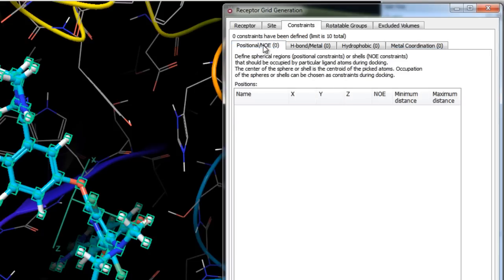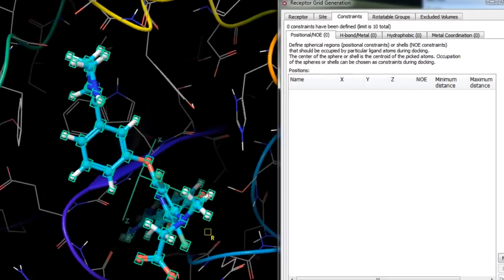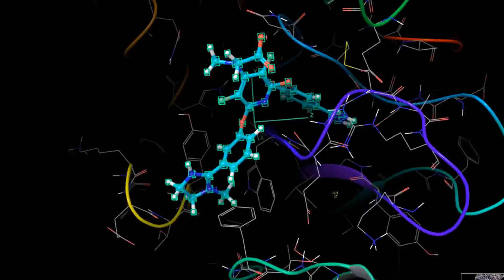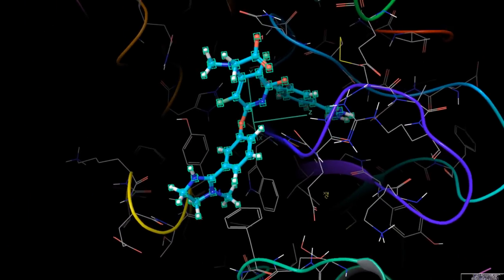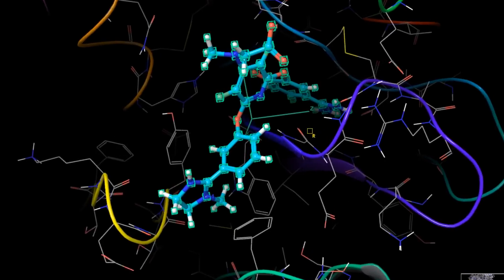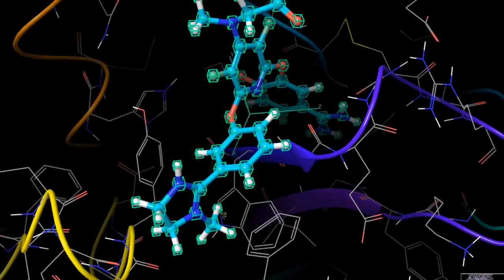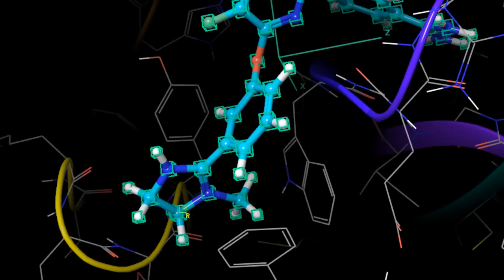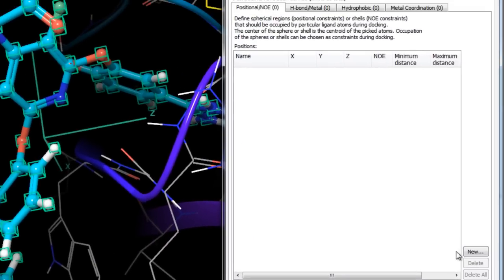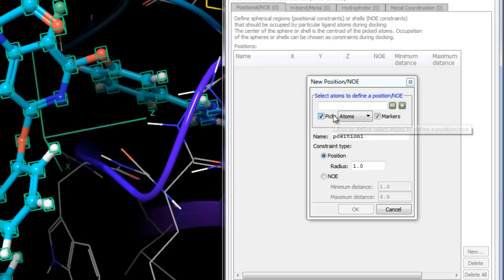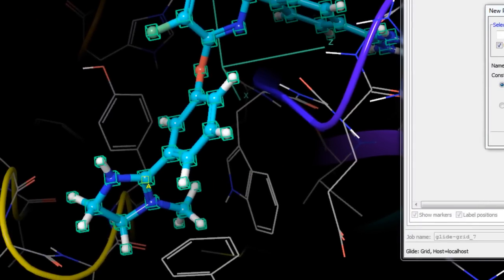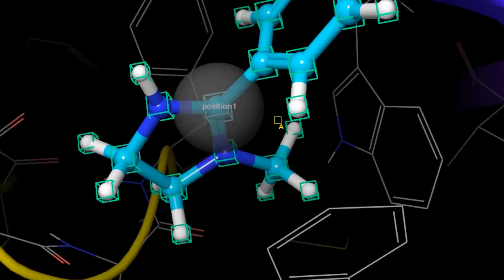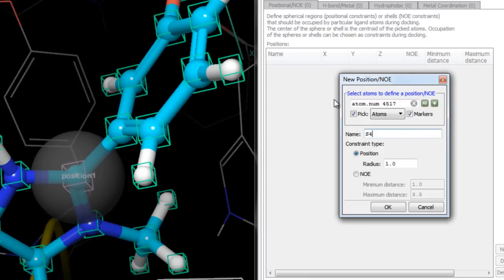A positional constraint is a requirement that one or more ligand atoms occupy a spherical volume centered at a particular position. The specific kind of atom is defined later during the docking stage using SMARTS patterns, but here we define the region in the active site. For example, to screen for ligands placing an aromatic group in the S4 pocket enclosed by three aromatic residues, choose New from the Positional/NOE Constraint tab and pick the atom to define the position.